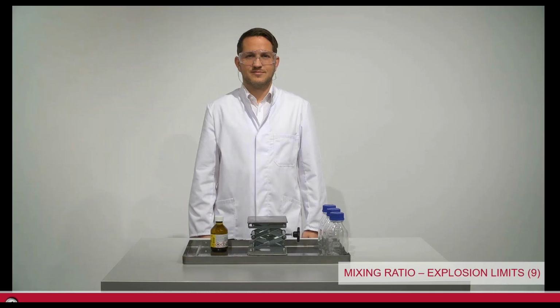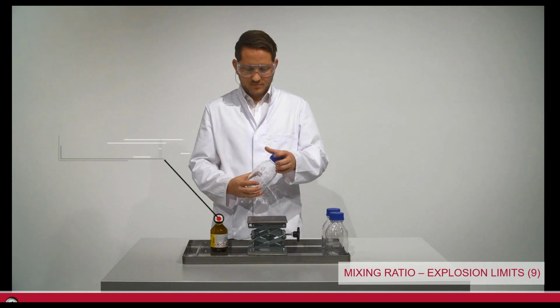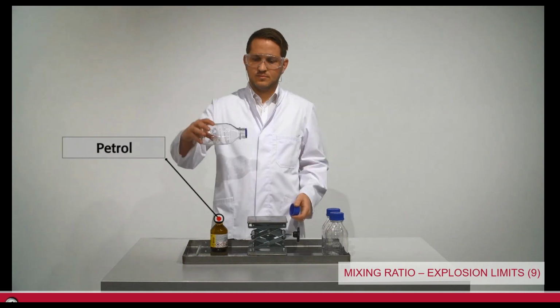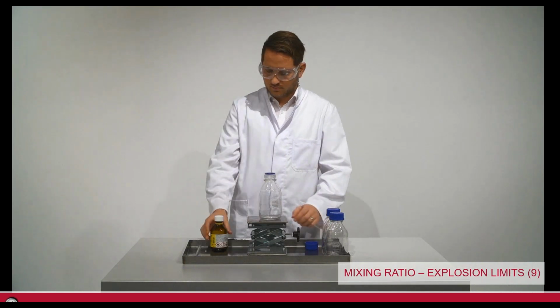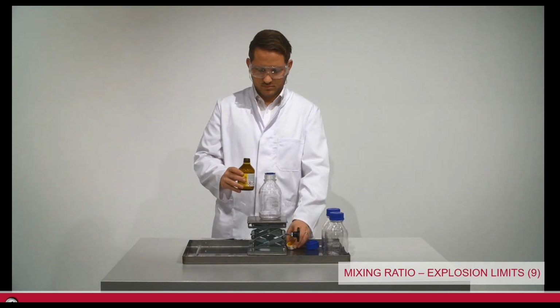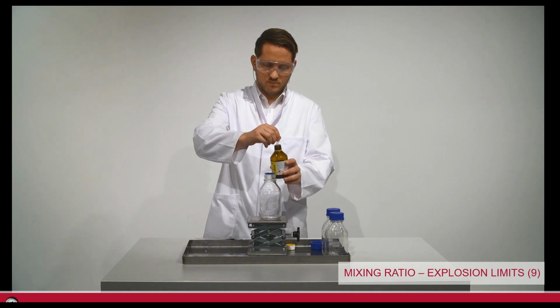So we're going to invite Sven back to our room. This is where things kind of get hairy for Sven. It's not immediately, it's a little bit throughout the process. I'll warn you before we get there. His process, he's going to put drops into a glass bottle. It already sounds fun, right? And then he's going to induce an ignition source and see if he can make things blow up. It's just simply that fun because we're trying to figure out where explosion limits are.